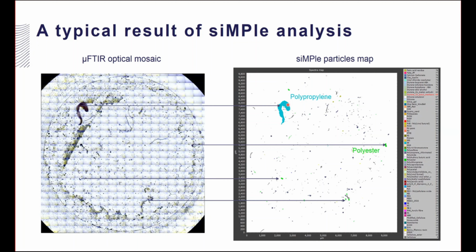Our software automatically re-images the different components in the sample, and it already assigned them a specific chemical identification without going through the image peak or spectral filtering that I described in a few slides before. So it's an improved tool to do semi-automated or almost fully automated chemical imaging data analysis.